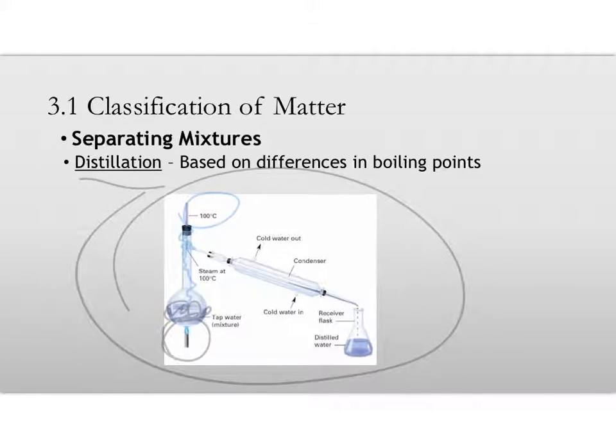It's stoppered off up here, so it will travel down through here as a gas. But surrounding that tube is an outer tube right here that has very cold water running through it. So that will recondense the vaporous water into the liquid state in here.